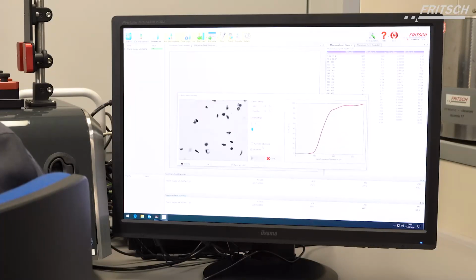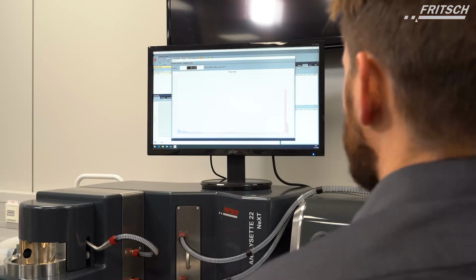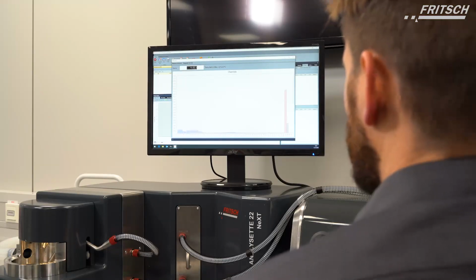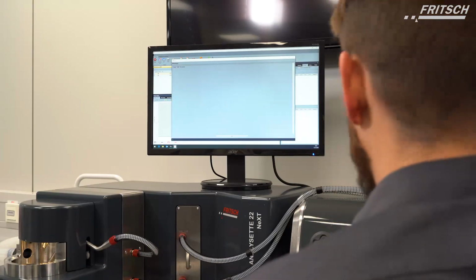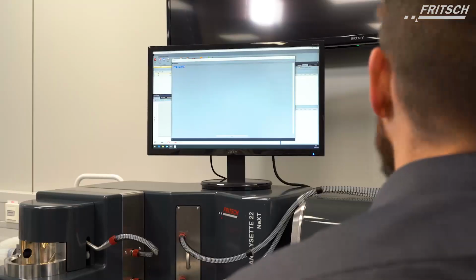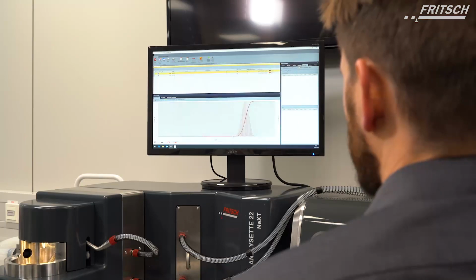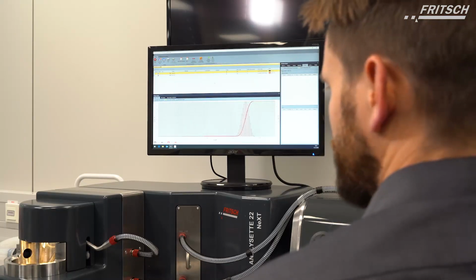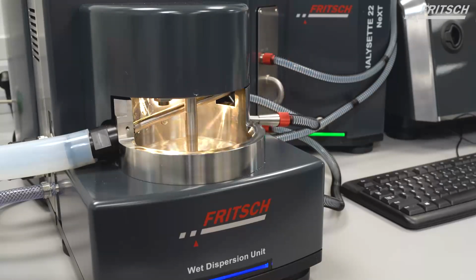The measurements of the A22 will be much quicker than the one of the A28. So once the two measurements which we set up in the SOP right here are done, we just keep the pump running in order to finish our measurement of the A28. Once we think we have enough data, we can also close the A28 measurement and at the same time finish the A22. The system will now automatically clean.